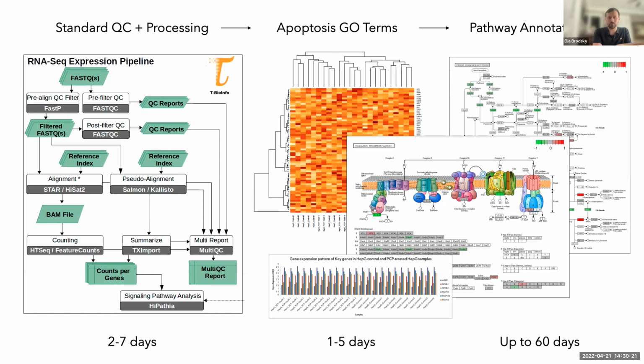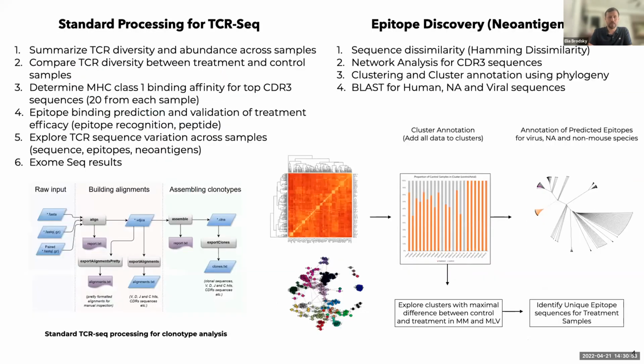Here you can see right away the time it typically takes. The sequencing core would sequence the samples, and then that would be uploaded to the Illumina BaseSpace account. From there, we take that, and very quickly we can produce the initial tables for you to work with if you know what you're doing. If you have additional requirements like differential gene expression or downstream annotation, that can take a little longer, because typically you would want to focus on some specific element and get down to a very detailed view of the biological questions you were trying to address.